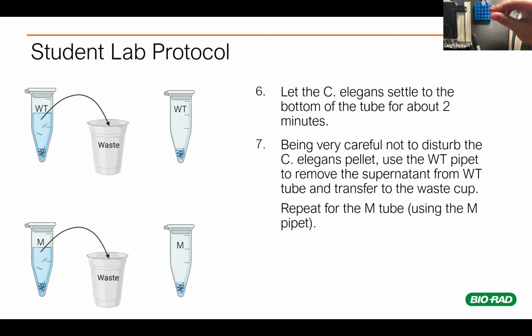And what you'll notice is that the wash buffer is probably pretty cloudy. All that cloudiness is those OP50 E. coli that the worms have been feeding upon for the last couple days. And so while they've been in there feeding upon those E. coli, they've been learning to potentially associate food, those E. coli, with the presence of salt in the NGM plate.